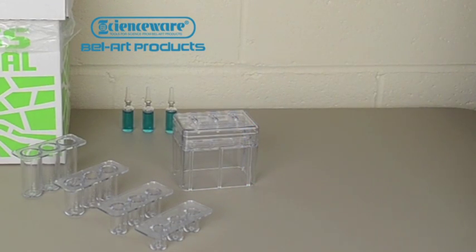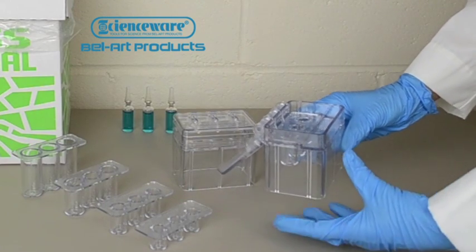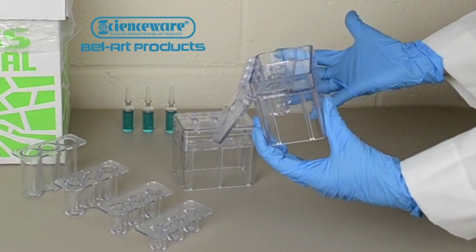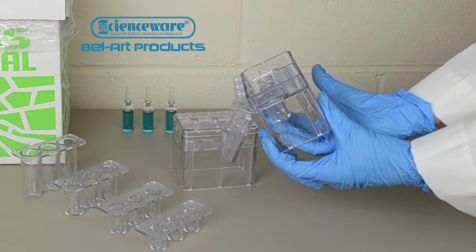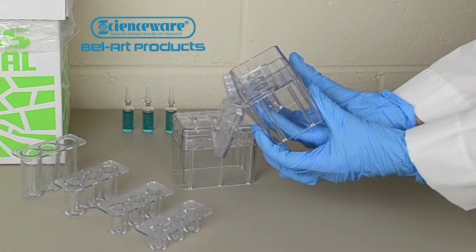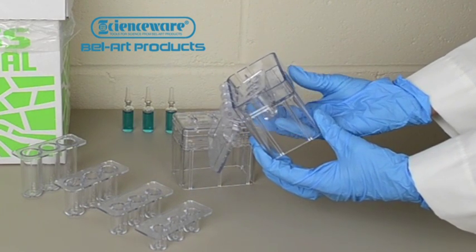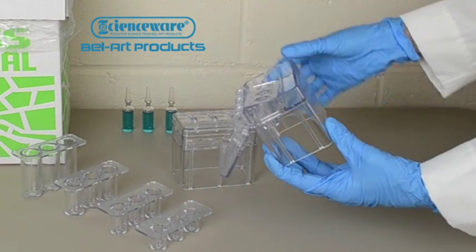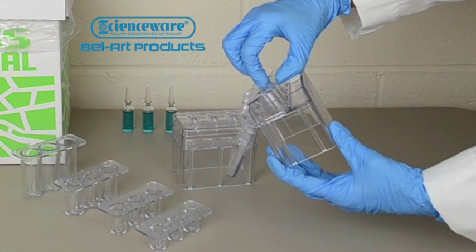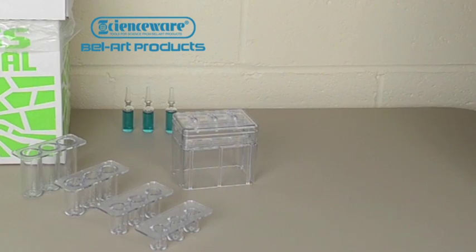To remove an insert, hold the ampule opener in one hand and use the fingers of your other hand to reach under the opener and behind the three columns where the ampules would be contained. Pull forward until the back edge of the ampule housing is no longer under the immobilizing lip. Grasp the front edge of the insert and lift.